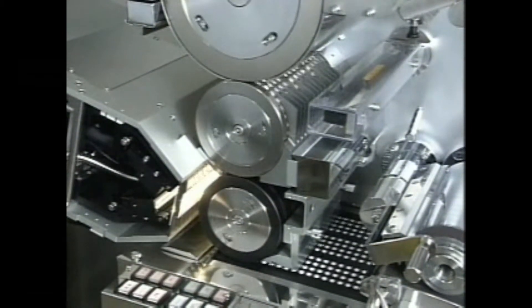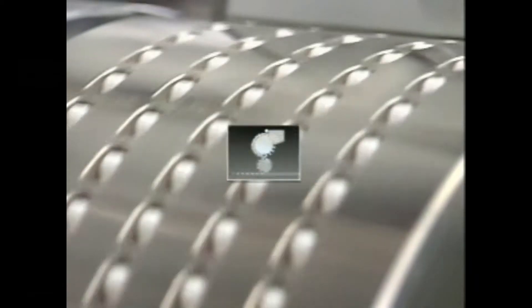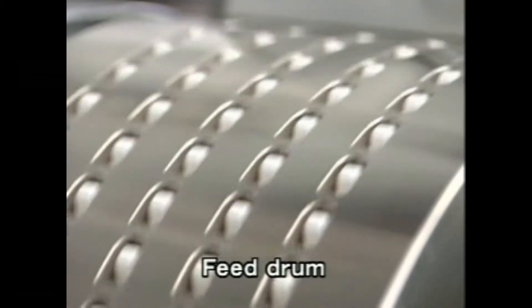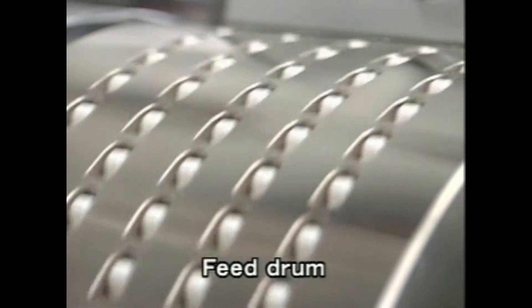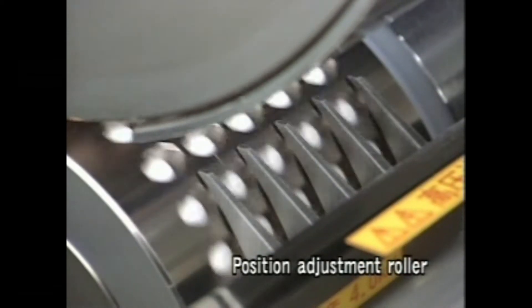We have succeeded in supplying non-round tablets almost perfectly by making use of differences in tablet thickness and length over the short tablet path. Via the vertical supply pocket in the supply drum, the tablets are transported to the rectifier roller that alters the tablet orientation to the horizontal.